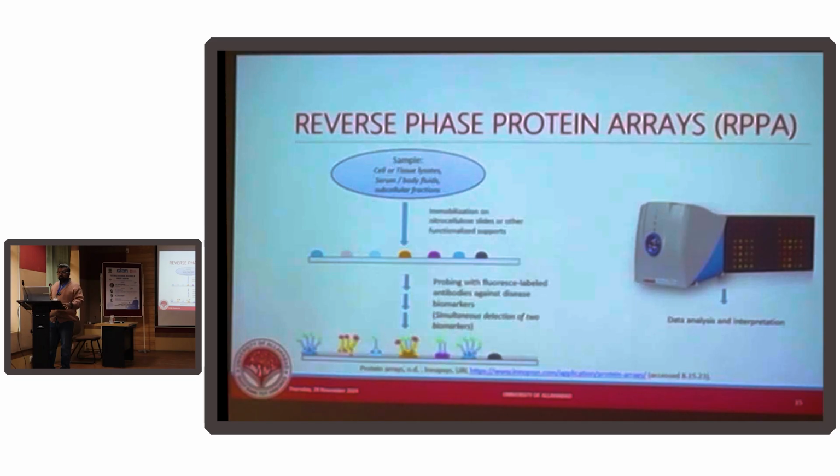The first grid, you can incubate with antibody 1, the second grid you can incubate with another, and there can be 8 grids or 16 grids on a specific microscope slide. If you have 16 grids, in one go you can assay for 16 different antibodies. If you have 2 types of fluorescence markers, you can go up to 32 proteins.